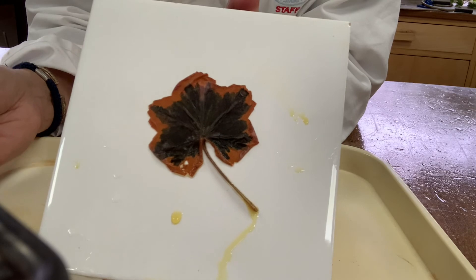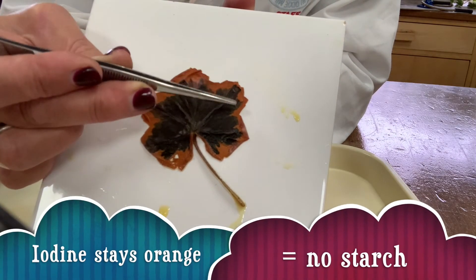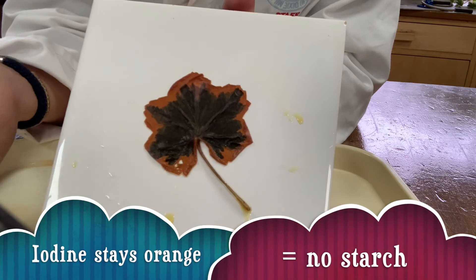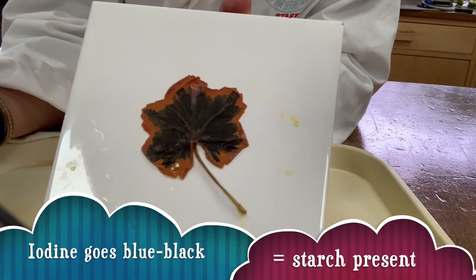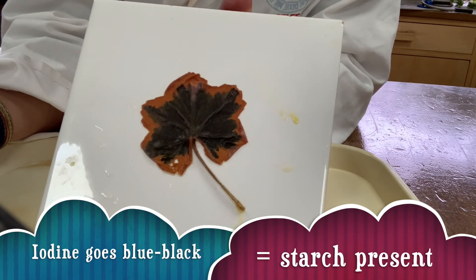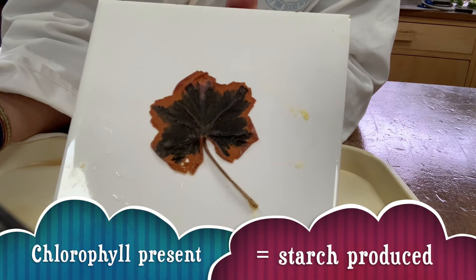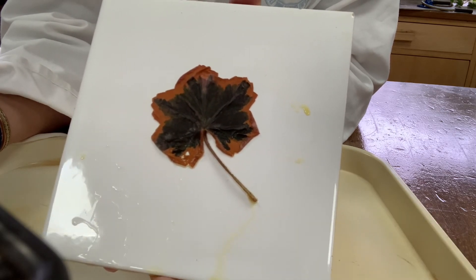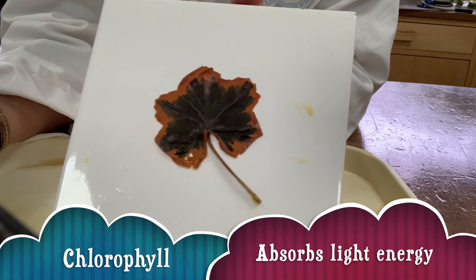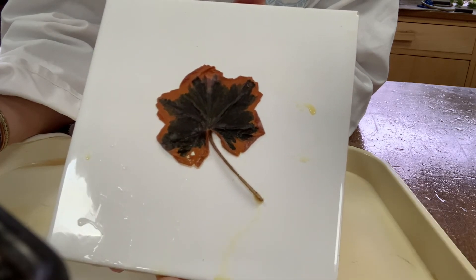As you can see from the results, they're very clear. Around the outside we have an orange area which is where there was no chlorophyll. In the middle where there was chlorophyll, it has gone blue-black, showing that starch is present. This shows that starch is only produced where chlorophyll is present, because chlorophyll is required to absorb sunlight energy so that photosynthesis can occur.